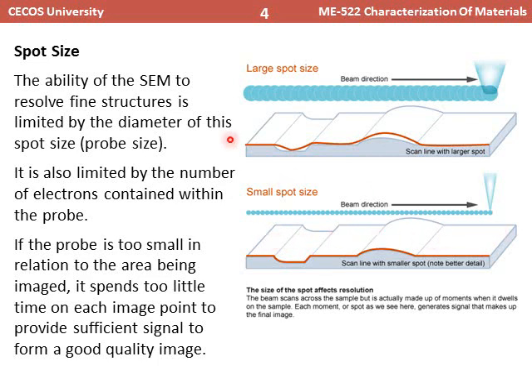The relative terms large spot size and small spot size are very important, and by decreasing the spot size, you are resolving the image to a very fine scale. If you want a quick look at the surface, then normally you use a large spot size, because in this case the line scans happen very quickly and less time is spent over the surface.